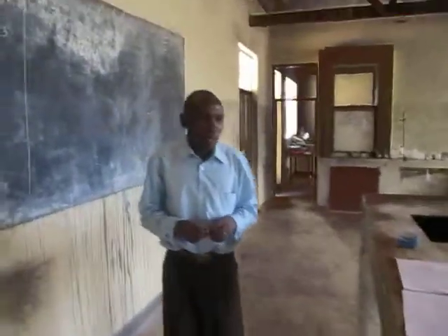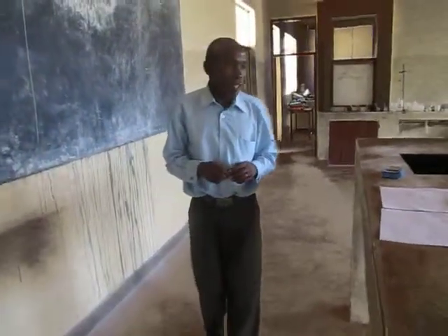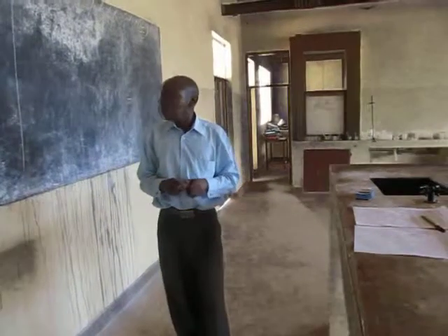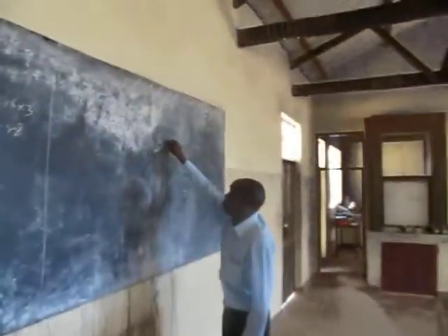How are you, students? I want to welcome you to this class, a chemistry lesson, and the area we're going to deal with is distillation.